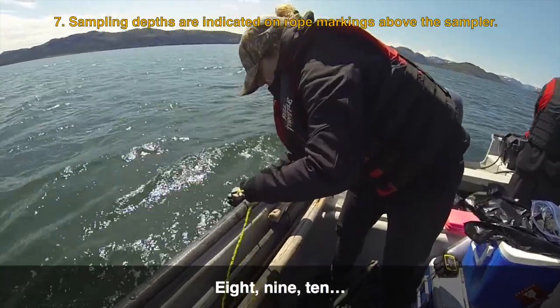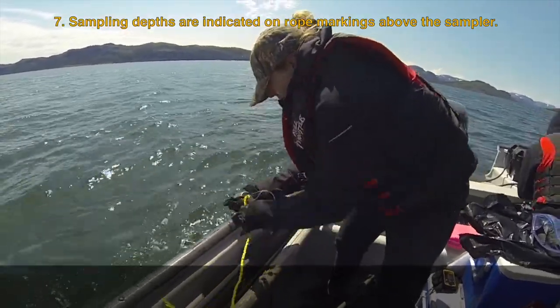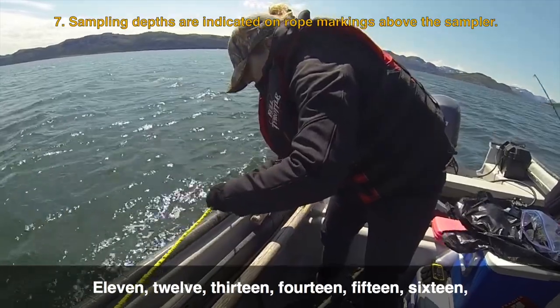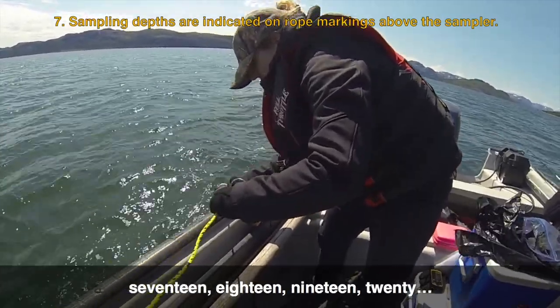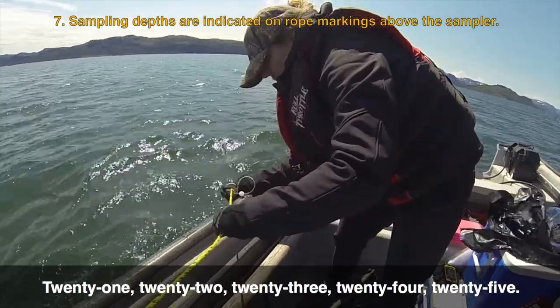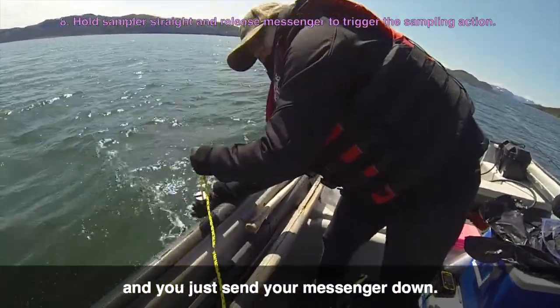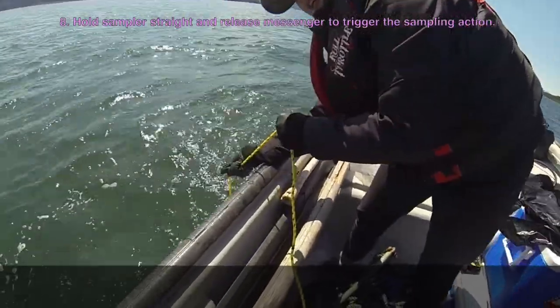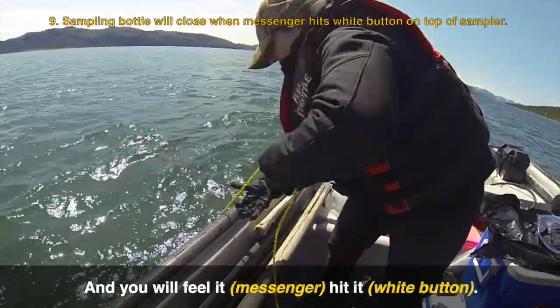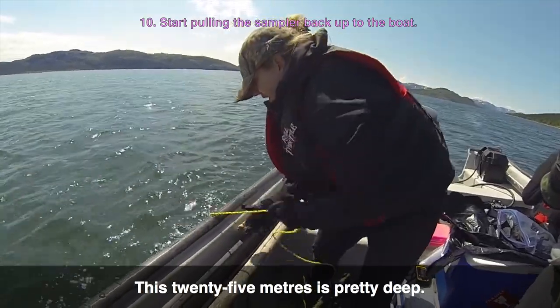Eight, nine, ten, twelve, thirteen, fourteen, fifteen, sixteen, seventeen, eighteen, nineteen, twenty. Okay, so your tape is just where your depth is, and you just send your messenger down. You will feel it hit it. This is 25 meters — it's pretty deep.